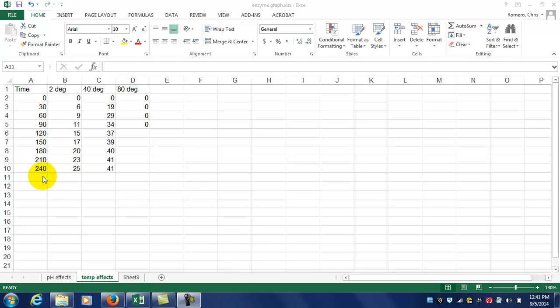In this video, I'm going to show you how to do the graphs for the Enzyme Activity Lab. This process will work for both sets of data. Remember that you have temperature-based data and pH-based data.